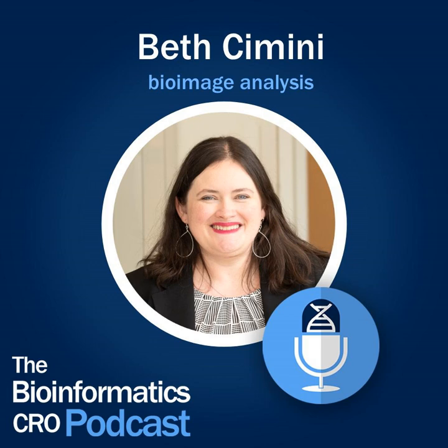What makes microscopy images hard to turn into trustworthy measurements? I think the thing that tends to be the most surprising to folks who don't spend a lot of time thinking about it is, for a lot of other modalities, we can very cleanly separate things. When we're doing a sequencing read and we see that we have a nucleotide polymorphism that is causing a biological change, generally speaking, the change in the sequence doesn't change our ability to do sequencing. Most biological changes won't affect the actual measurement.